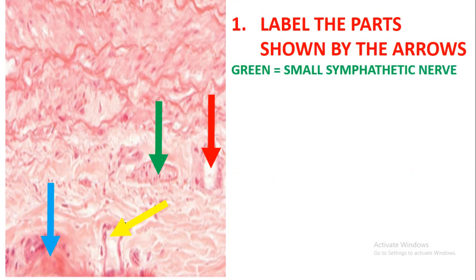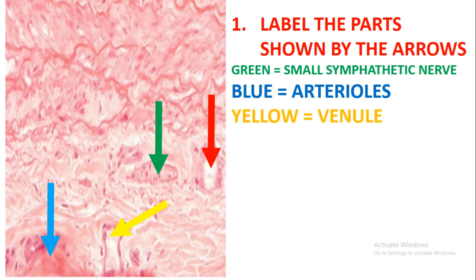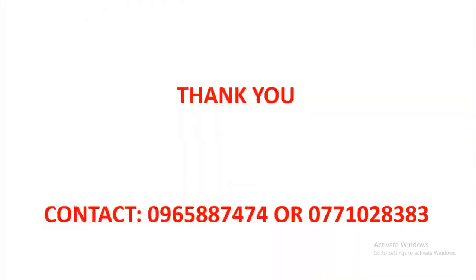Label the parts shown by the arrows on the next slide. Green is showing the small sympathetic nerve — as you can see, the part pointed by green has no lumen. Blue is showing the arteriole, and yellow is showing the venule.